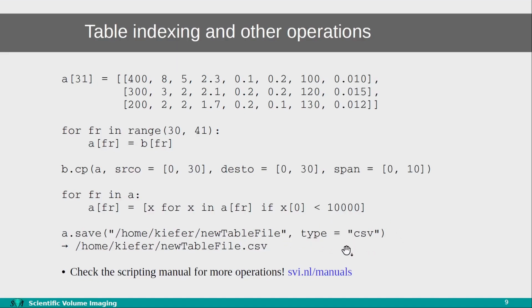Now these are just a handful of operations that I've shown for the tables, but there are many more, just like for images, and you can find detailed information about these operations by going to the scripting manual, which can be found at svi.nl/manuals.